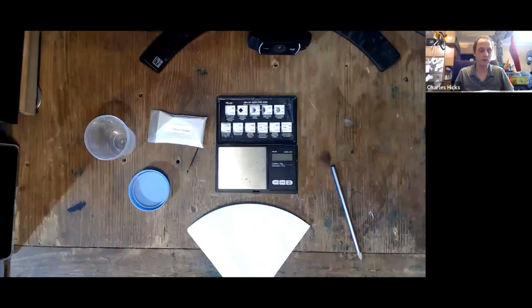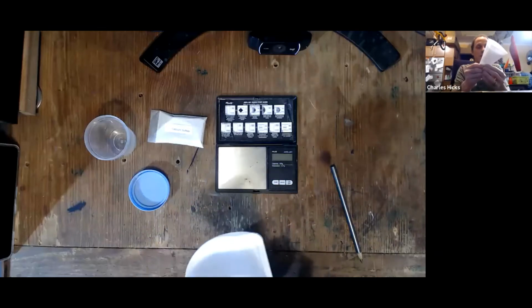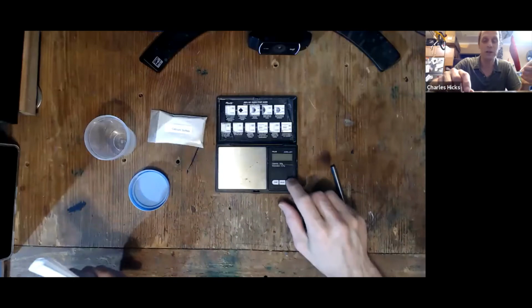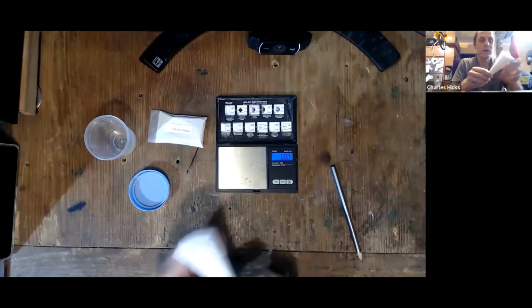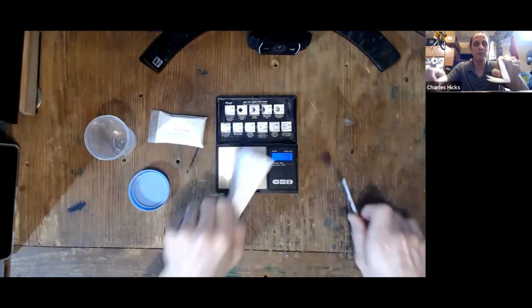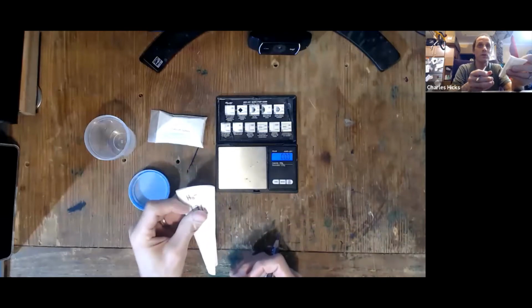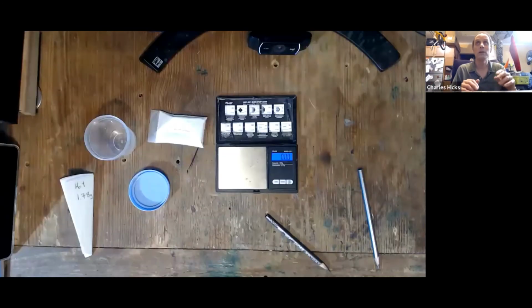Now, the first thing we have to do is a few weighings in advance. You're going to do this 3 times with 3 filters, but take your filter paper, and you want to fold it up so that when you lay it on the scale, it doesn't flop around and go off the pan of the scale. Turn the scale on, wait till it reads 0, and weigh your filter. Now you want to notate that mass on the filter, along with a notation of which trial you're going to do. I'm going to do the hot water trial, so I'm going to write hot on that. Okay, then you can put that off on the side.